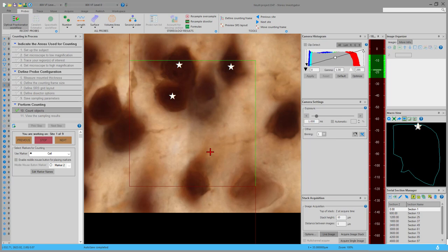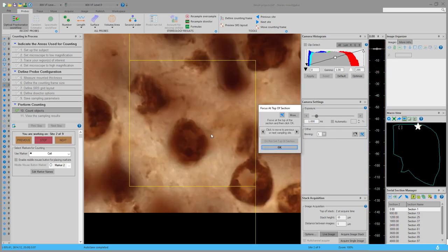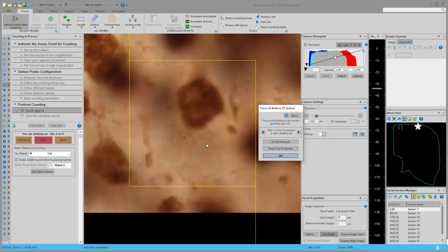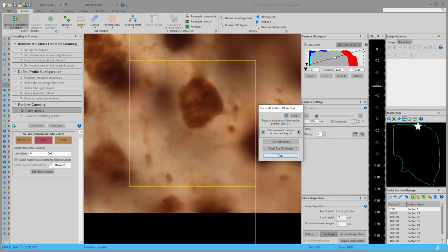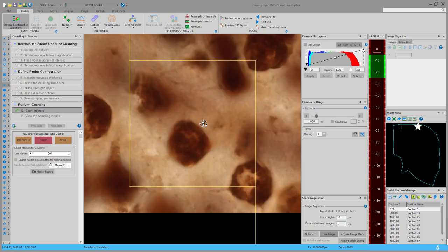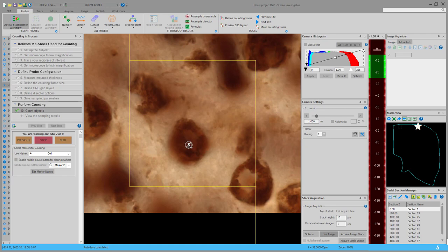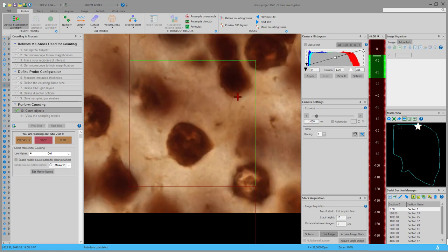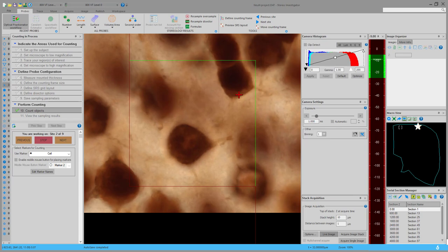I think I've marked all of the cells for this site. Let's go ahead on to the next site and repeat this process. We'll focus up and down to find the top and bottom of the tissue. We're measuring at every site to make sure we have an accurate representation of the thickness of the tissue. We're going to make sure not to mark cells we see right at the top of the tissue because the tops of these cells are probably somewhere up in the top guard zone.